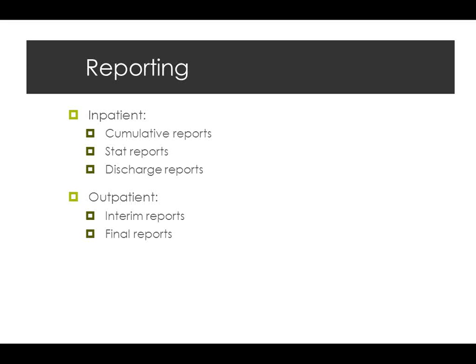In terms of reporting, inpatient reports, I mentioned the cumulative reports we used to print every day. We don't do these. You may want to print stat reports like to the emergency department. Now with EHRs, that's going to them directly and they get alerted. Discharge reports so that you could send it to the referring physician on the outside, everything that was done on the inpatient stay, or for convenience for dictation, so the docs have everything there in front of them at one time. Obviously with EHRs you don't really need that.